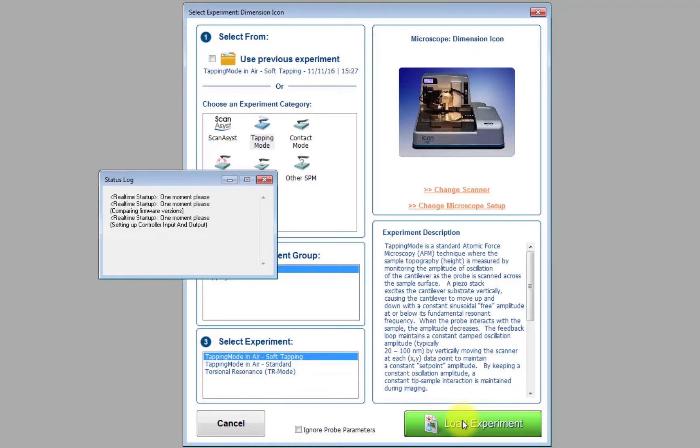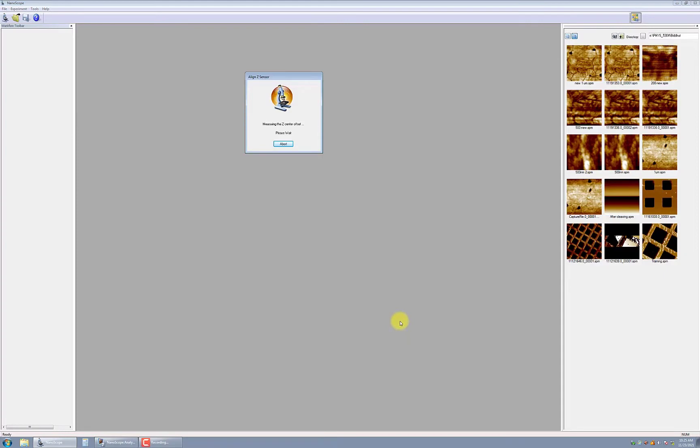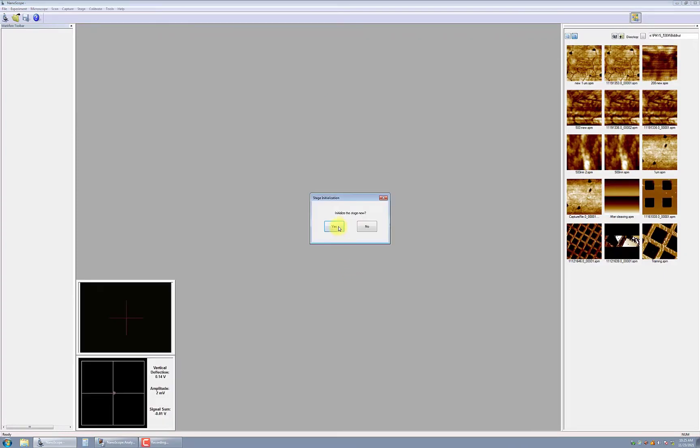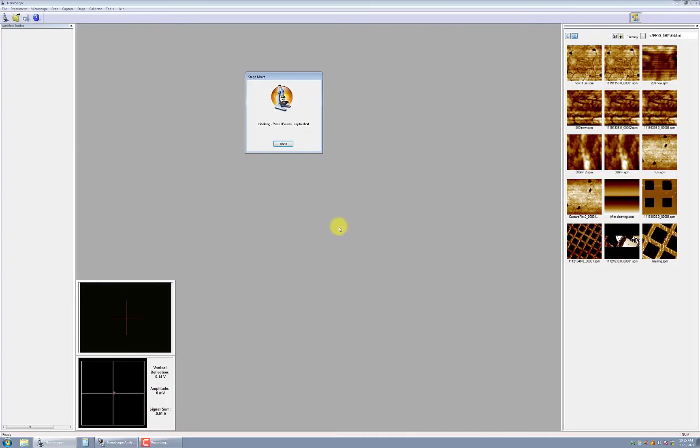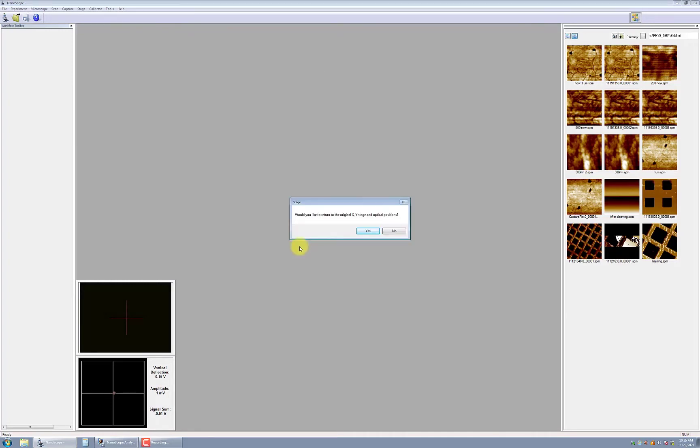Next, a dialog box will pop up asking to initialize the stage. Click Yes. The stage will move to various locations for initialization. Then, a second dialog box will ask if you would like to return to the original stage and optical positions. In this case, click No.